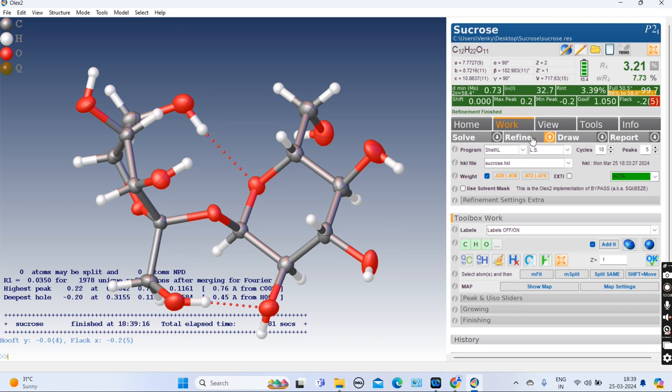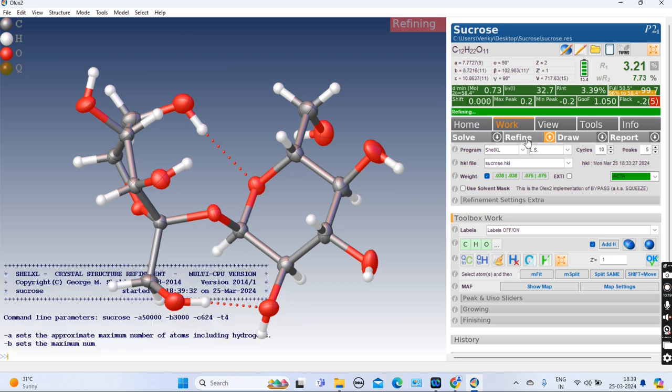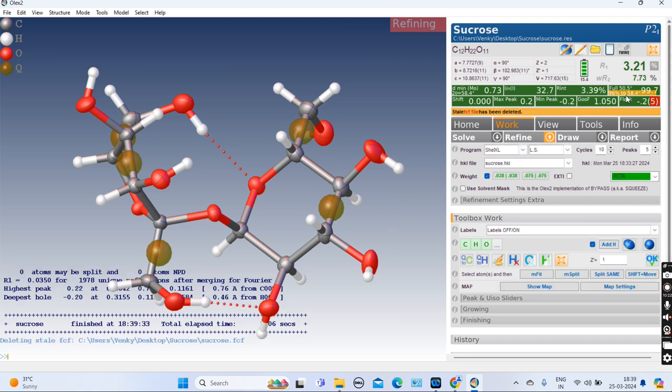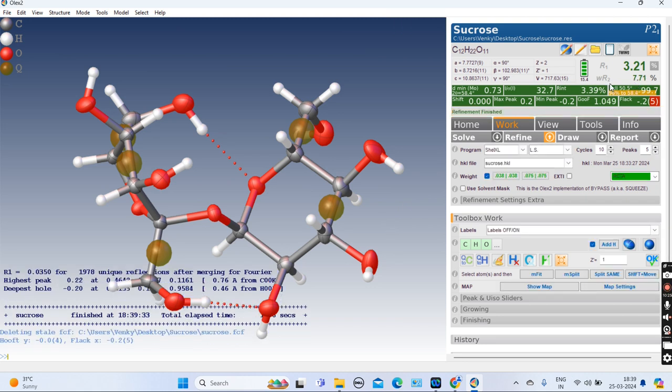This structure is already solved. You can see the R factor is 3.21%. Then WR is about 7%. It indicates that we have done this refinement pretty well. This WR2 should be within 3 times of the R1. In our case, it is already within 3 times of R1.